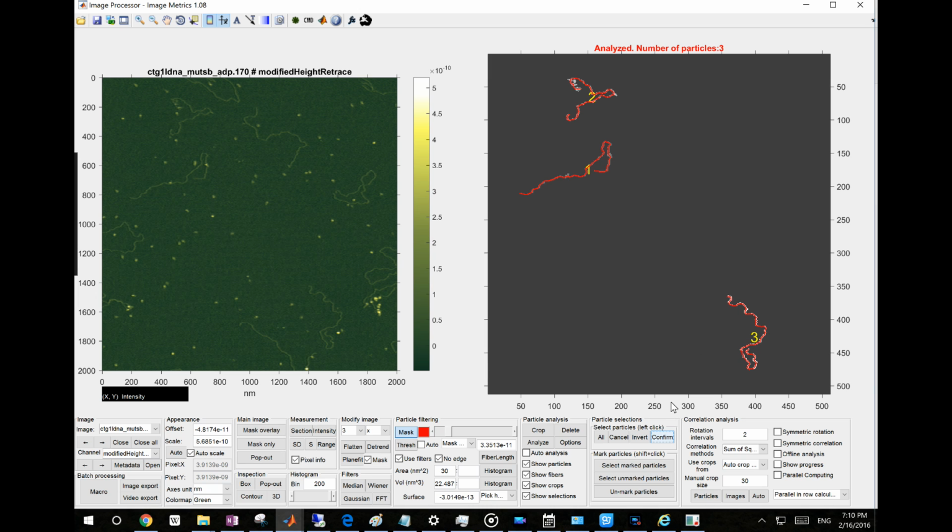This is not required if you do a particle analysis, because the outliers are not very useful. They are usually small in number, and they can be easily categorized because they either have larger volumes or erratic lengths, and you can always exclude them from the analysis in the particle analyzer. So I don't really find them very useful in this part, but for some people it might be useful. But you can always exclude any of the particles, either automatically or manually, in the particle analyzer modules.